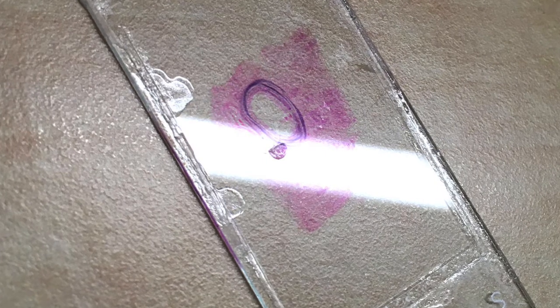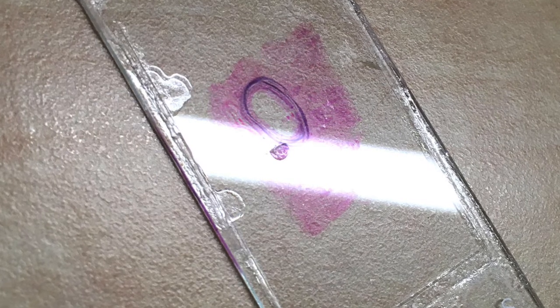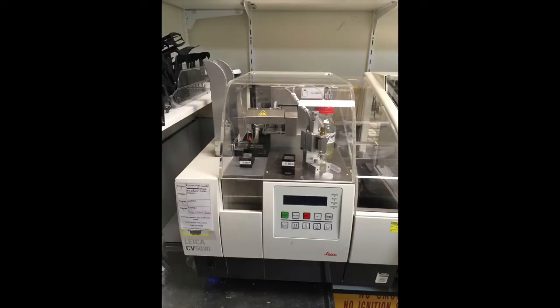So what's the best way to ensure that you are cover slipping your slides in a reproducible manner without any issues? Well, if you work in a laboratory that's routinely processing large numbers of slides every day, you'll probably have access to one of these automatic cover slippers. But even in the case of these devices, they often can and do sometimes have problems. And so having a knowledge of how to manually mount cover slips is a really useful skill for any histologist.